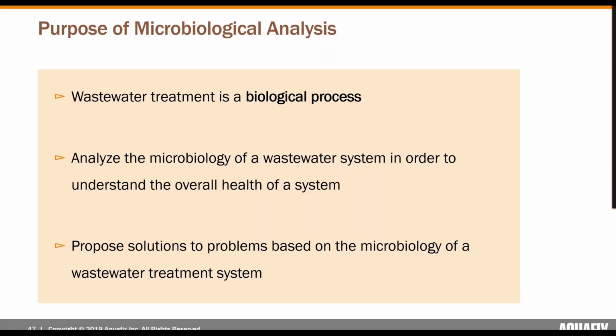In summation, we would like to remind everyone about the importance and purpose of microbiological analysis of wastewater samples. Wastewater treatment is first and foremost a biological process. And Aquafix really prioritizes analyzing the microbiology of a wastewater system in order to understand the overall health of a system. And so through this microbiological analysis, Aquafix is able to propose solutions for problems within a wastewater system based directly on observations from a wastewater plant's biology.